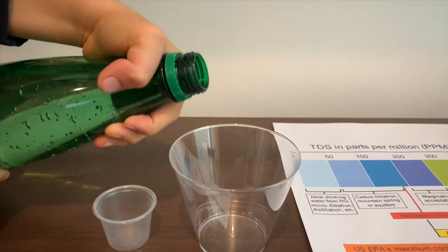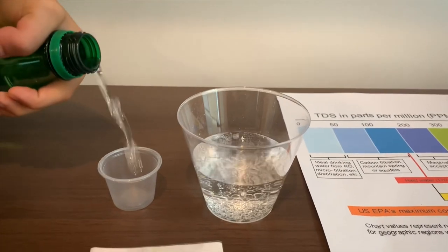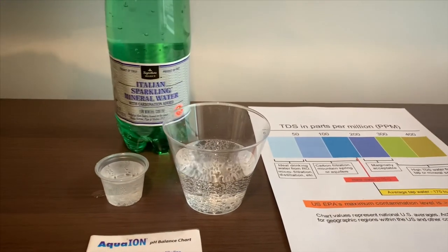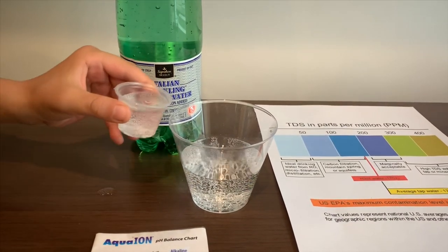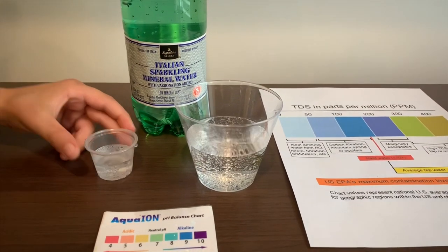Let's pour some water in. This is a little too much for the pH cup. Let's pour some back in for the TDS. First we're going to test the TDS level.